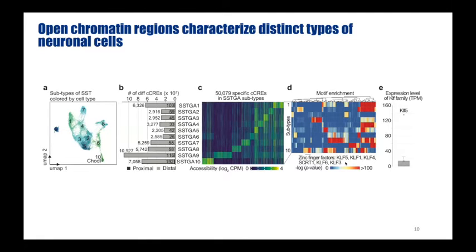And this is also valuable to check the other modality. For example, you can check the expression level from RNA-seq data so that you can make sure which TF is more likely to be the driver TF.